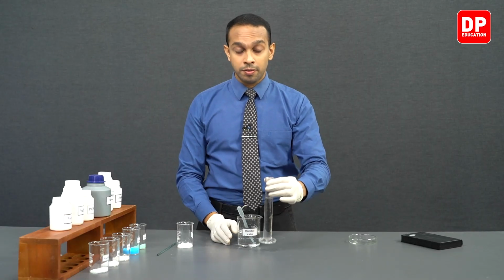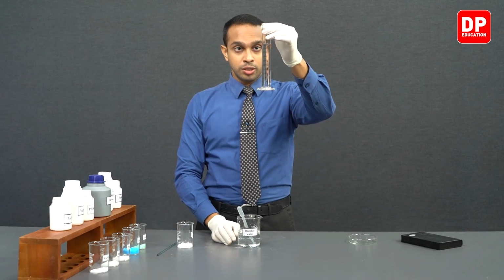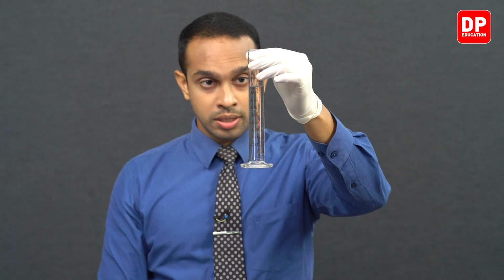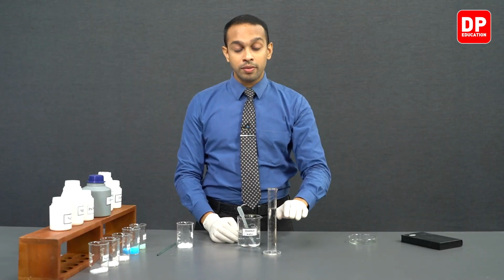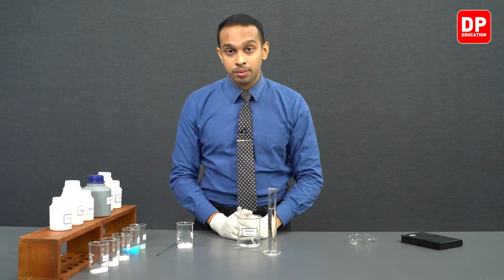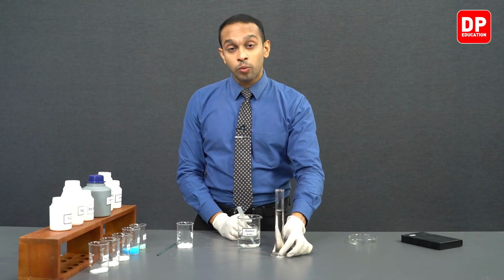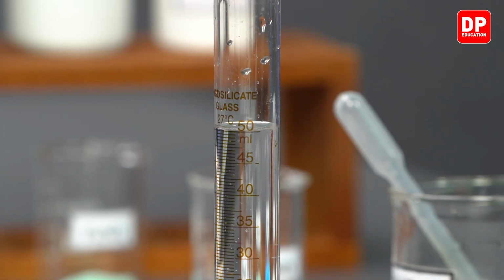After adding 50 milliliters of water into the measuring cylinder, students, you can bring the measuring cylinder to your eye level, or you can bring your eye level to the level of the 50 milliliter mark on the measuring cylinder, and ensure that the volume that you have measured is correct.